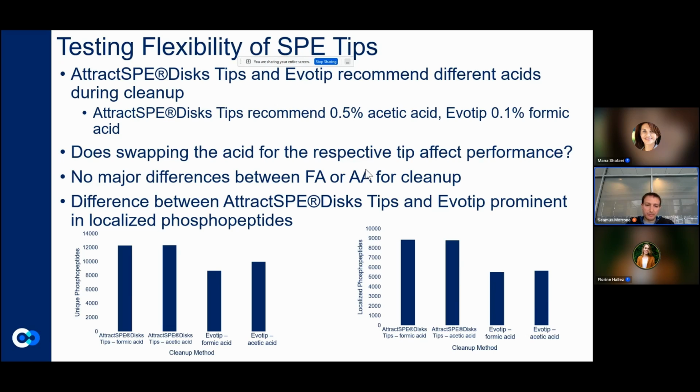They're all very similar at both the non-localized as well as the localized level. But we did find a slightly better recovery using acetic acid with the evotip. But in both instances, the Attract SP Affinisep tips were performing better, and this was more pronounced at the localized level.